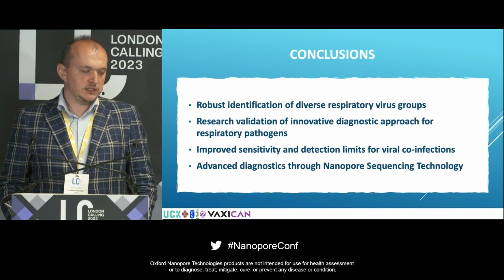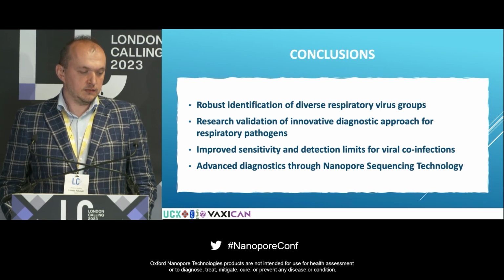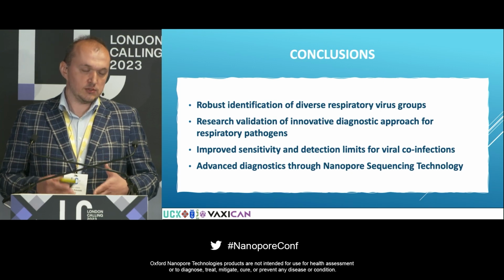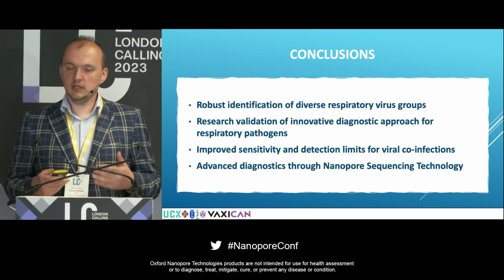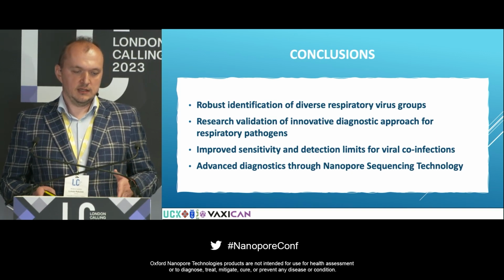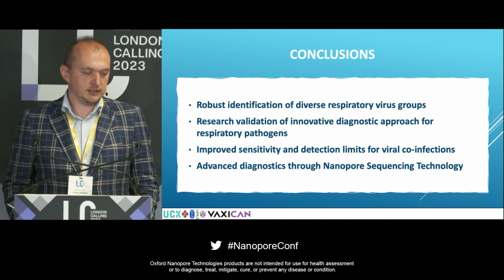We were able to detect as low as 10 copies of the virus per sample, but work is still ongoing. This happened only because of nanopore sequencing, because we were not looking for a signal, we were looking for the sequence. Because of that, you not only detect, but you can also see how the epidemic is spreading, who is infecting whom. That is impossible with other technologies.